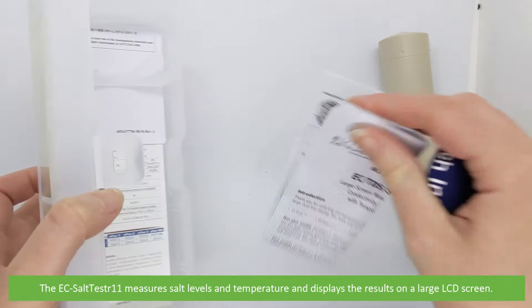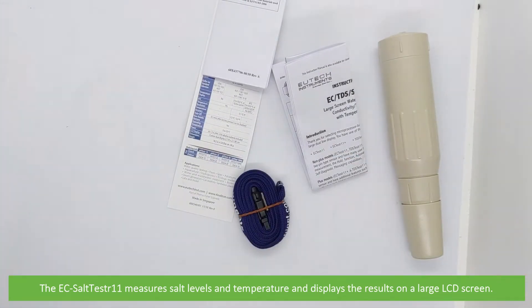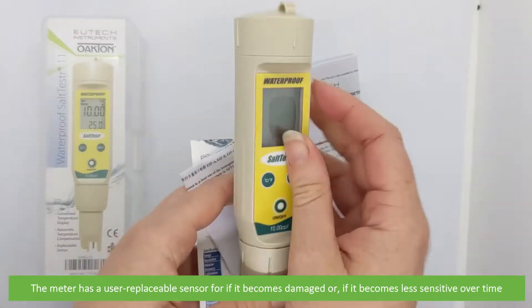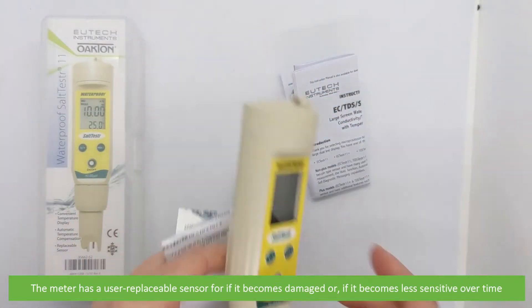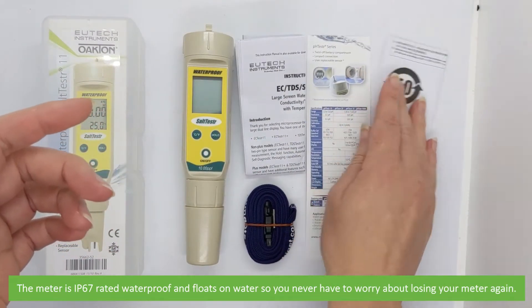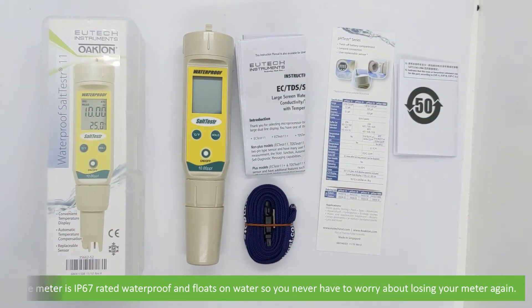The EC Salt Tester 11 measures salt levels and temperature and displays them on a large LCD screen. The meter has a user replaceable sensor for if it becomes damaged or it becomes less sensitive over time. The meter is IP67 rated waterproof and floats on water so you never have to worry about losing your meter again.